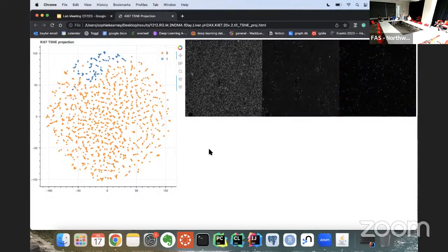In terms of your presentation, it's also good if you can go through the manuscript Jatushan and Priscilla have written and get an idea about how the models are trained, what kind of models are used, and stuff like that. You don't have to do it, but it's good to know. Yeah, I did abstract a lot of those details because I wasn't totally solid on all of them, but I read the manuscript and thought, oh, that's how that works, now I get it. So I think it'd be good to incorporate those details, especially the SimCLR thing that you mentioned. I knew that, but I had forgotten to mention it, so I think it'd be good to include that.